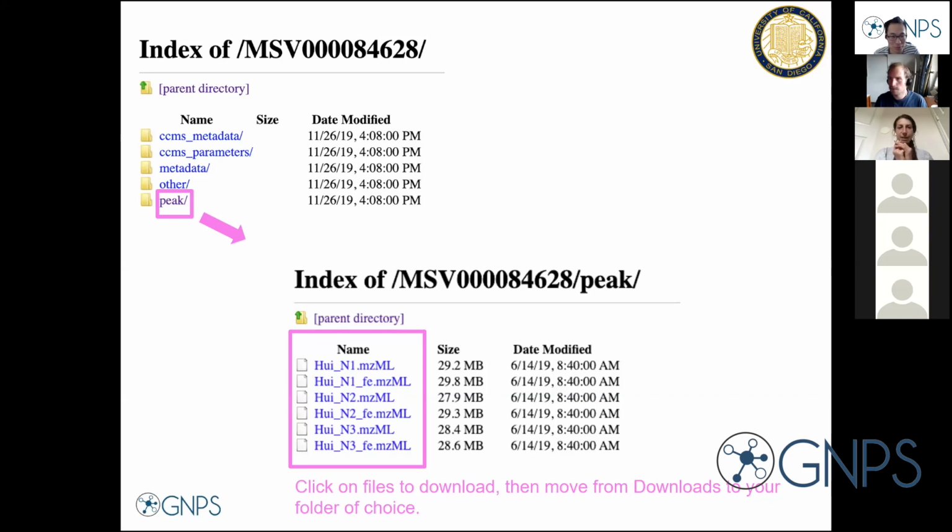Okay, well, it seems like from the chat, most people have had success. So. Okay. Cool. Then let's move on to MZmine.